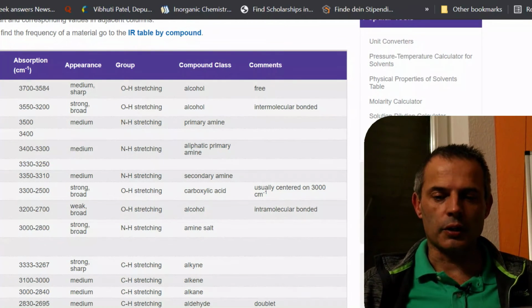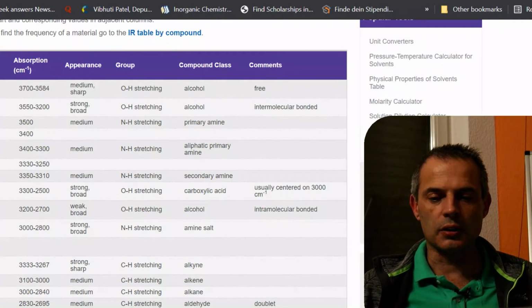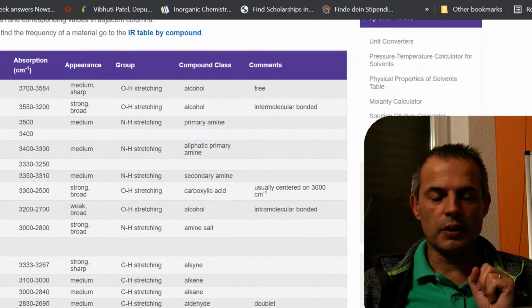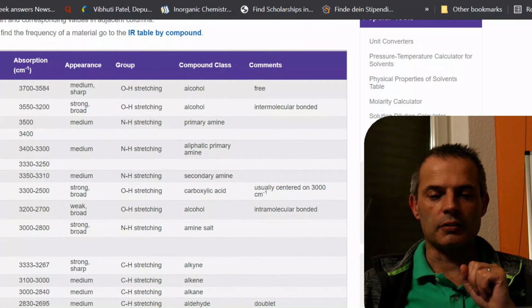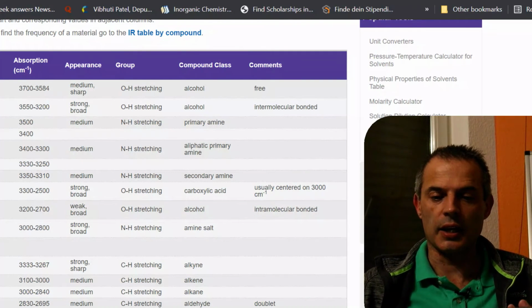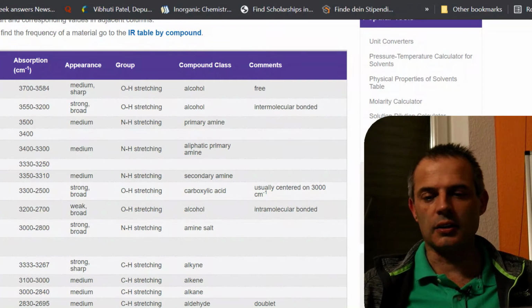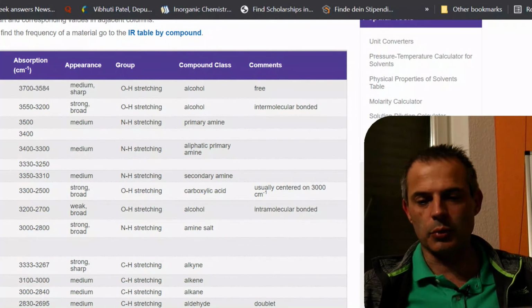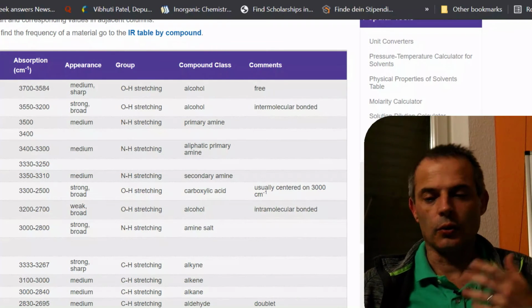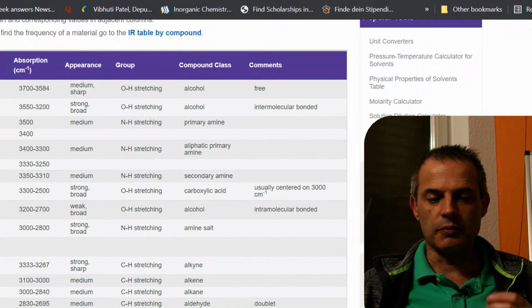If we have a molecule that only has CH3s in it, like tertiary butyl something, then we will obviously only see 2 of those. And if we have molecules that only have CH2s in, which is fairly common in rings, because then there isn't an end, or in really, really long hydrocarbon chains, then there's comparatively little CH3s compared to CH2s. In those cases, we only see 2 peaks, or we see 2 big ones and tiny ones. That usually tells us some information.